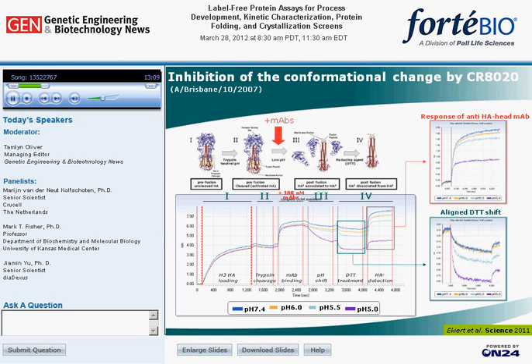Next, antibody was bound, followed by a pH shift and the DTT treatment. Already in step 3 it was observed that CR8020 dissociated at the lowest pH. As a result of this, the head and stem parts of HA started dissociating. This was confirmed in the last step using an HA head binder. Whereas at a higher pH, much less dissociation was observed, indicating that 8020 actually prevented a conformational change of HA, thereby inhibiting fusion of the virus to the target cell.